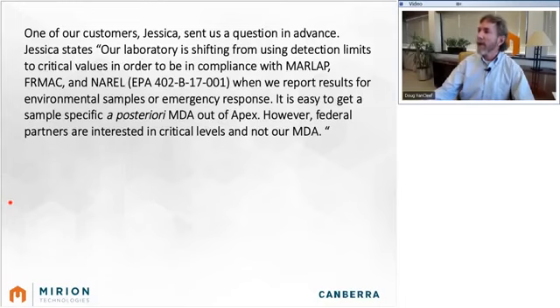It's a great question. How often? The question is, how often should we do these calibrations? At least I think that's the question. Sorry for the little technological delay there. It's a great question. Most of the existing consensus standards have recommended calibration check frequencies in that.